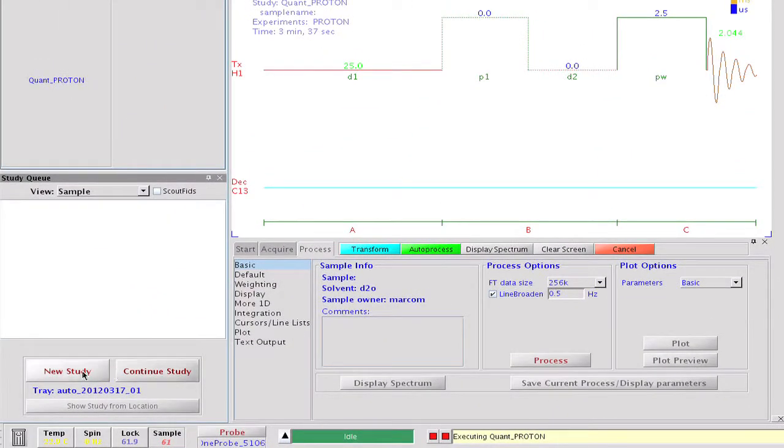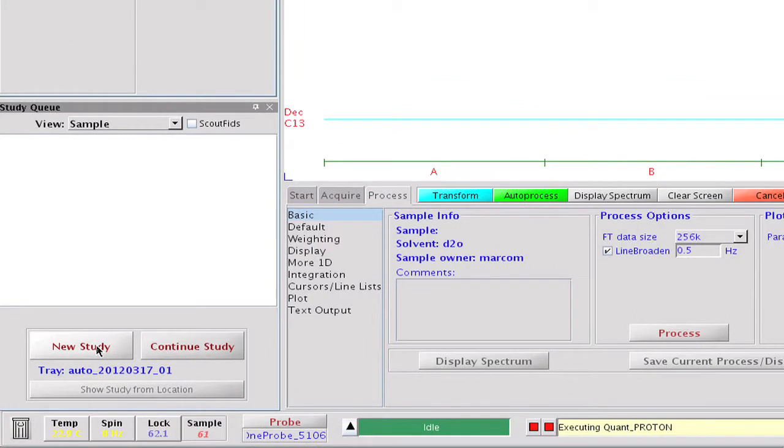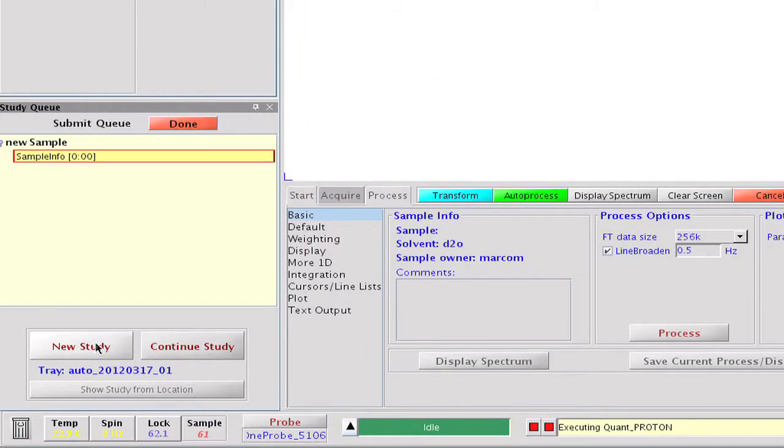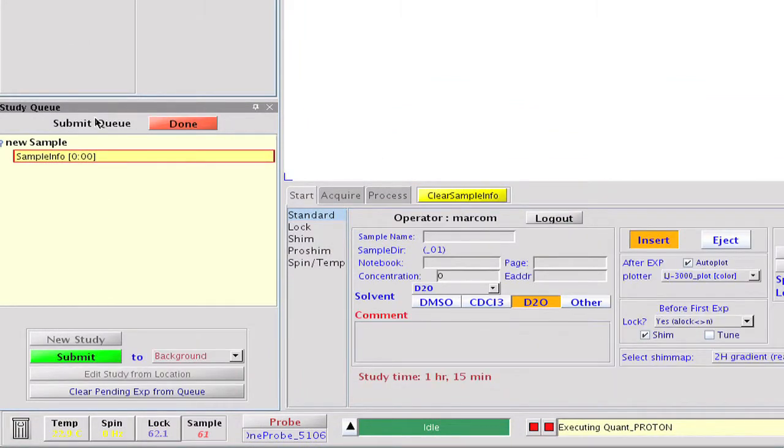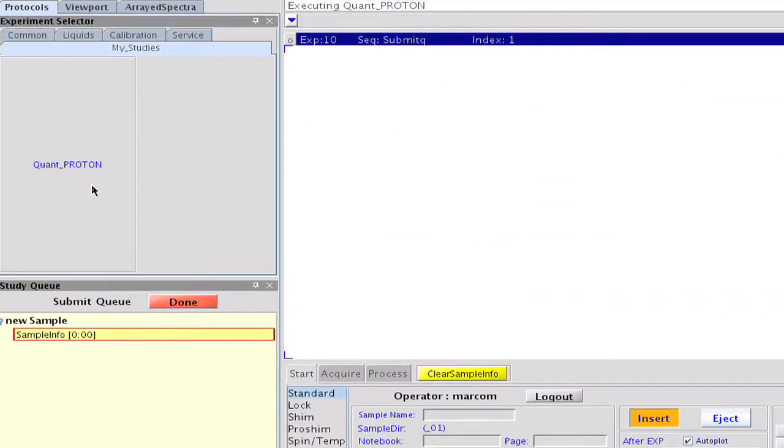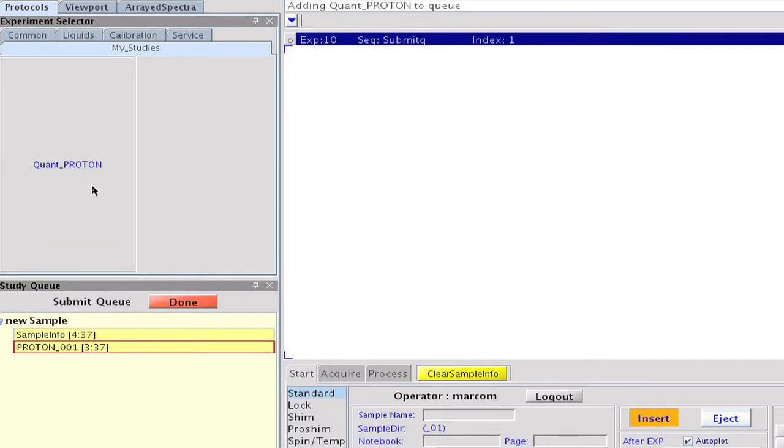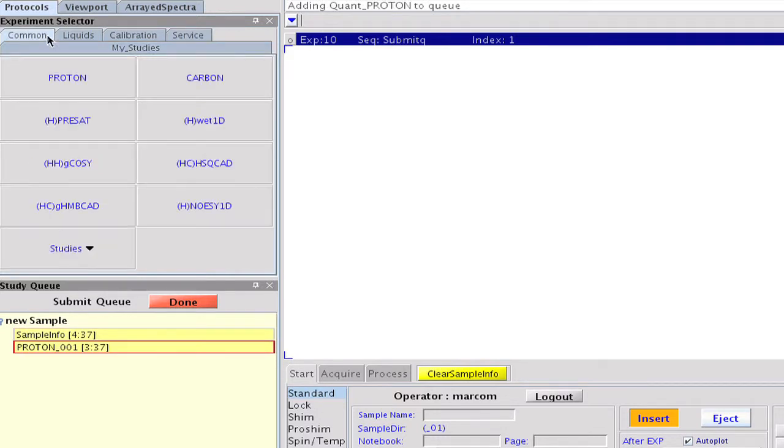Study clones can also be used to create more complex lists of experiments. For example, we could use the new study button to move the software into submit mode, then populate the study queue with a list of experiments we want to run on a series of samples. Note that we can add a previously created study clone to our new study if we so desire.